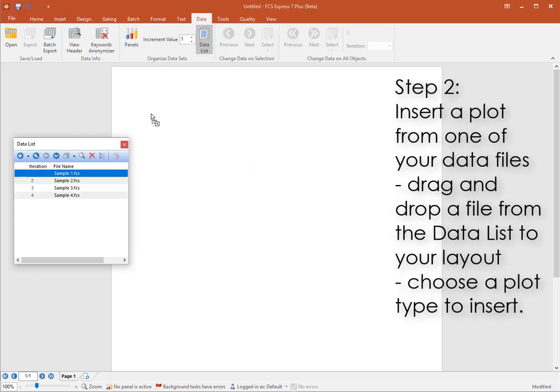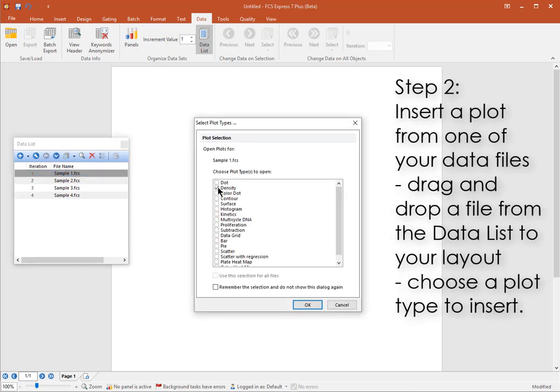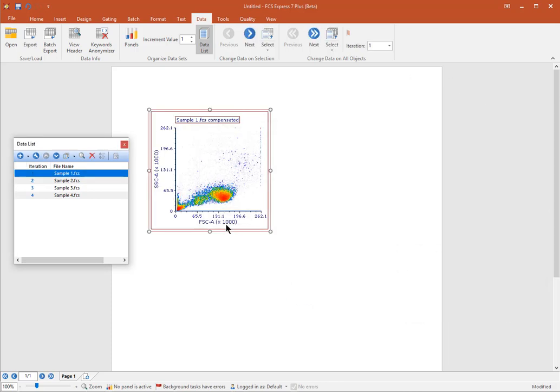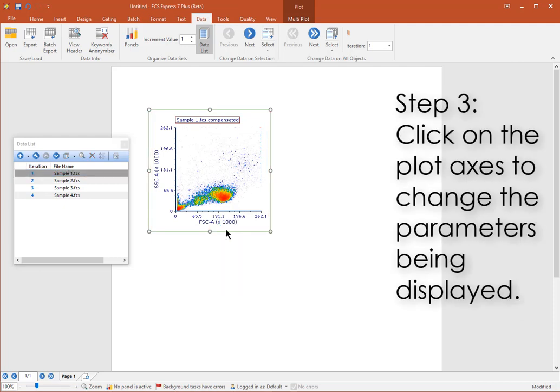Drag and drop the first file to the layout to insert a plot type of your choice. Click on the plot axes to change the axis parameters.